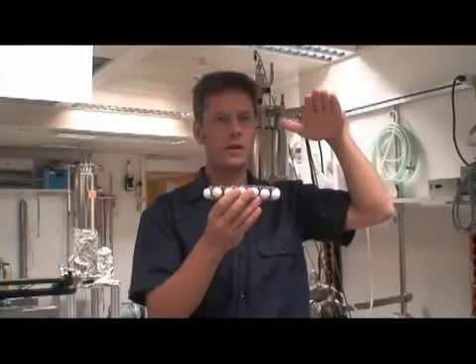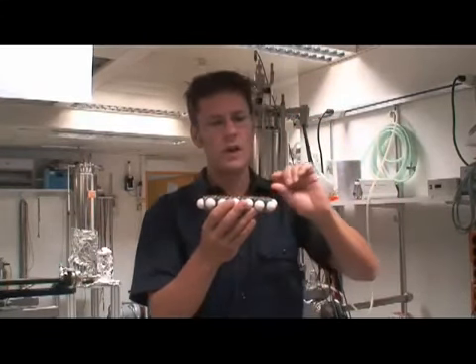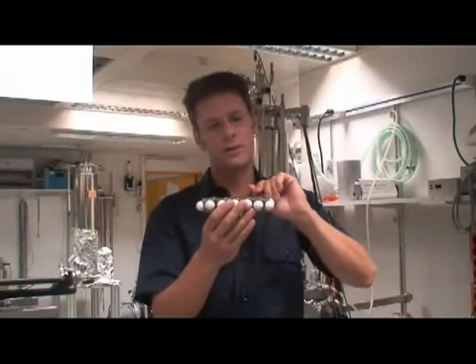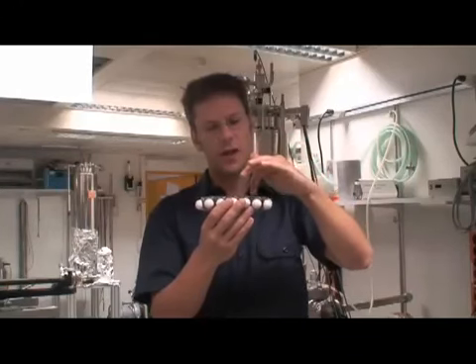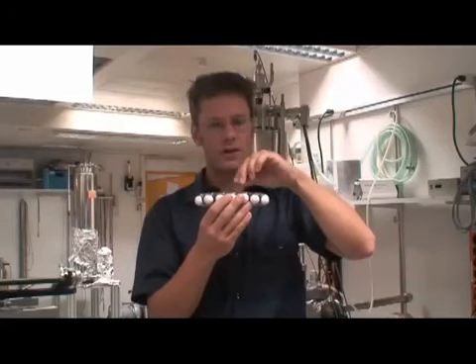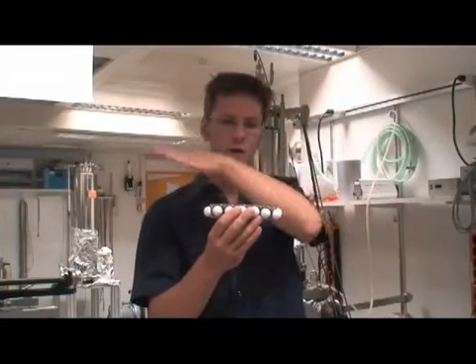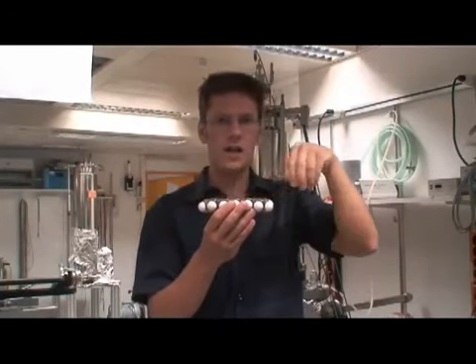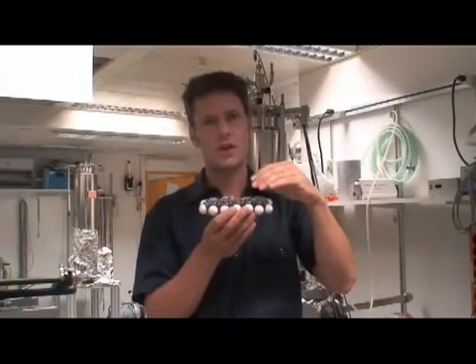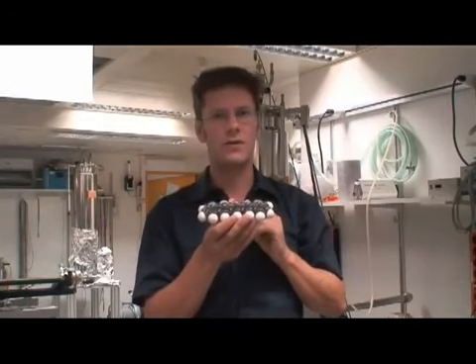And only when we go very close, we see on top of this attractive potential a smaller repulsive force. And this is due to the Pauli exclusion principle. This happens when the electron orbitals of the CO tip and the pentacene molecule start to overlap. And then we get this Pauli repulsion. So we have this large attractive force that also gives us the dark halo surrounding the molecule. And on top we then get this tiny corrugation which tells us the atomic positions and also the bond between the carbon and hydrogen atoms."